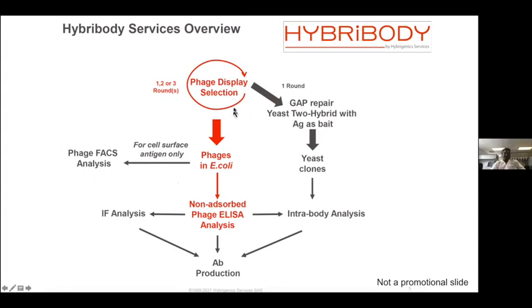Here we are expressing nanobodies on the phage and doing a phage display to select the nanobodies that are specifically binding. First you pass those phages through the negative selection antigen, which would remove everything that would non-specifically bind to either the duplex or the solid support. Then you take the rest of them and pass them through the positive antigen, and you will be able to get the binders that are binding to your sequence.